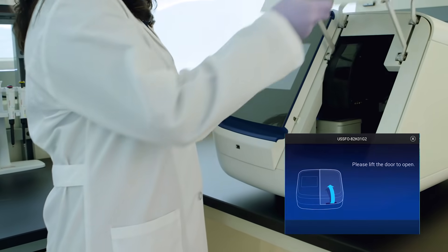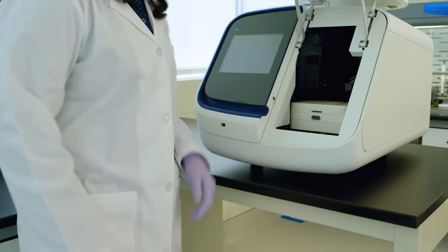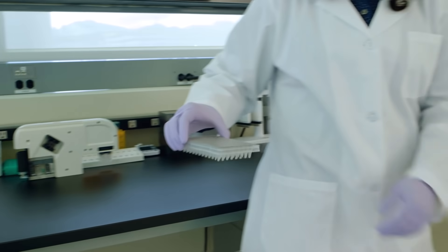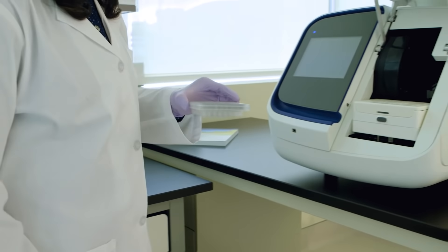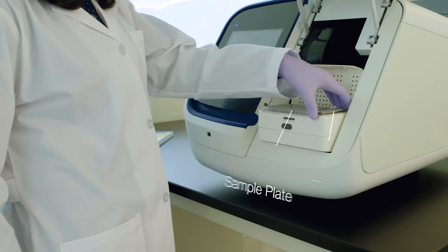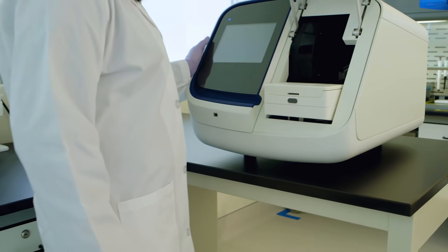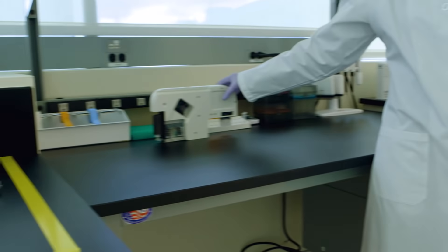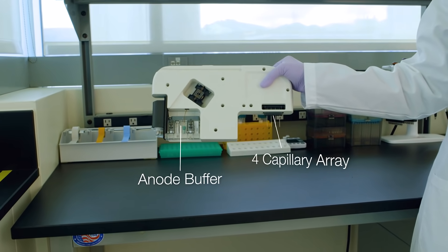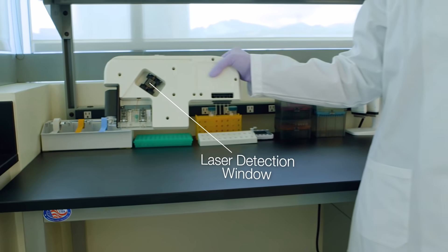Open the door. Samples are prepared just like you're used to. Insert sample plate, cathode buffer, and the cartridge. This includes everything you need: the capillaries, anode buffer, polymer delivery system, pop-on polymer, and the laser detection window.